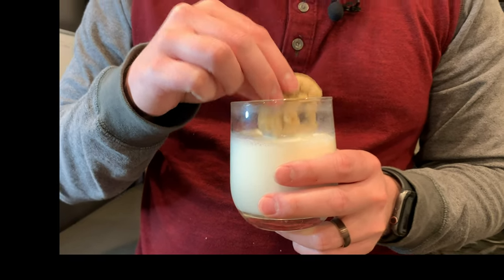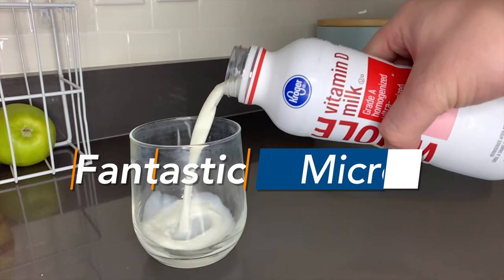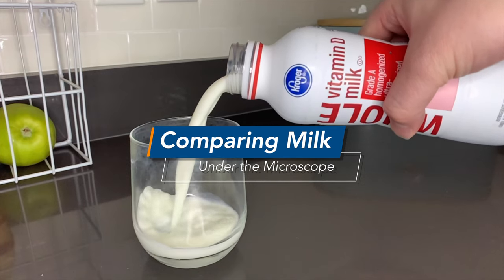What goes better with milk than cookies? Milk and microscopes. That's right, my friends.